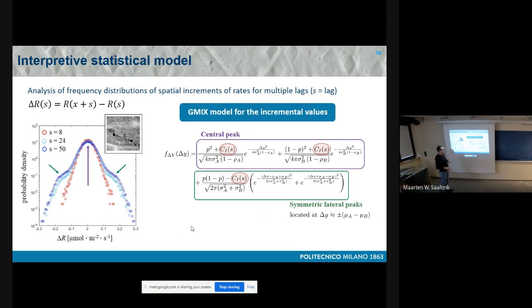Okay? So, in essence, we came up with this interpretation, which hopefully is compatible with the nature of, at least in this case, bimodal. We hope it can be extended to multimodal, but for the moment, for bimodal. So, starting from a bimodal Gaussian field, then you can come up theoretically with a distribution of spatial increments, which has all the features of the data that we have seen.